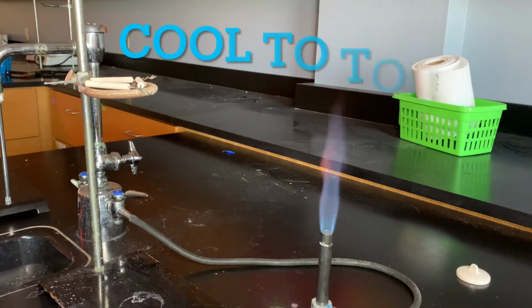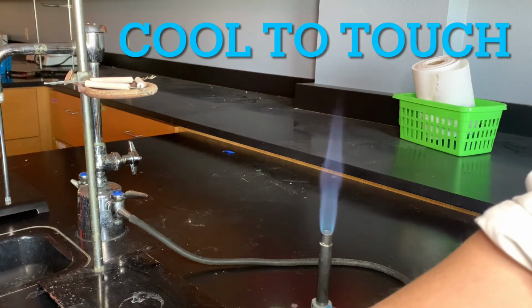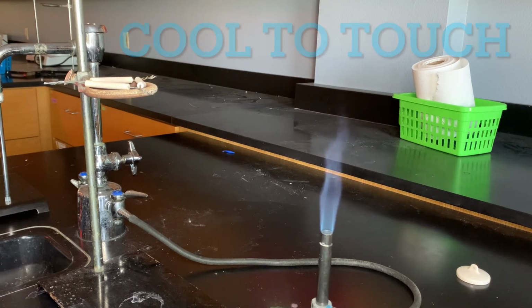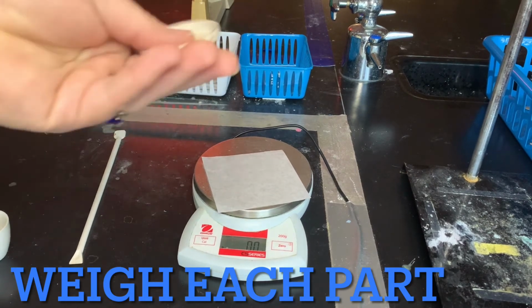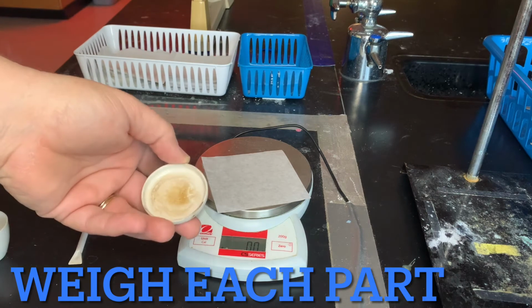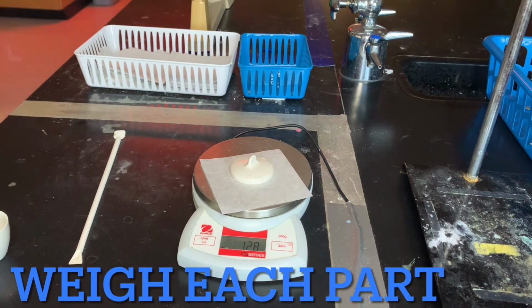Now, how do I know when my crucible's cooled down enough that I can start working with it? It's really simple. If you can't put your hand around your crucible without being burned, it's too warm. Simple, simple. So once it's cooled off enough that you can handle it in your hand, then we need to weigh it. And so we do have weighing paper on the scale. We'll simply place our lid on there. We're going to weigh it and record it.